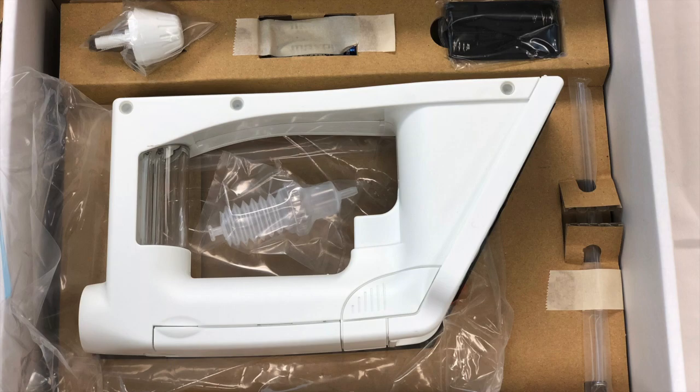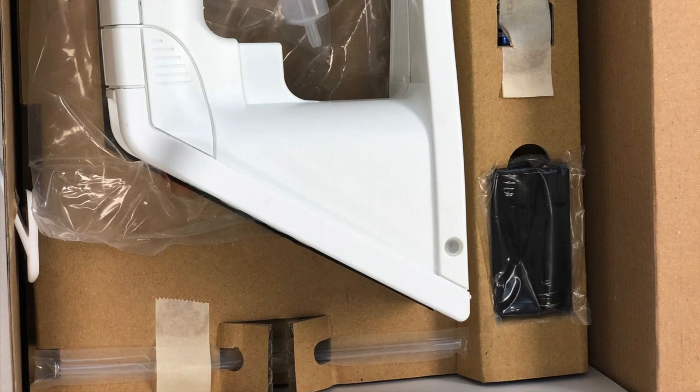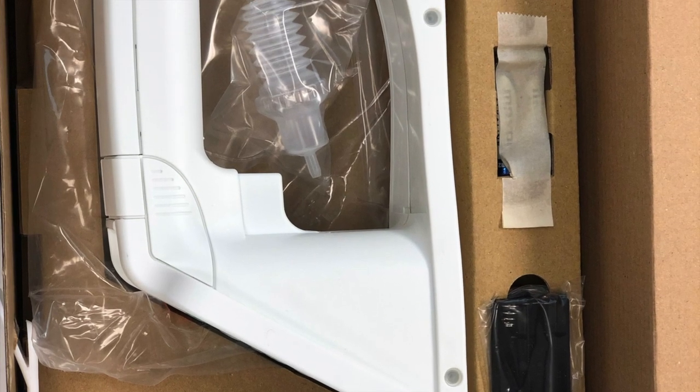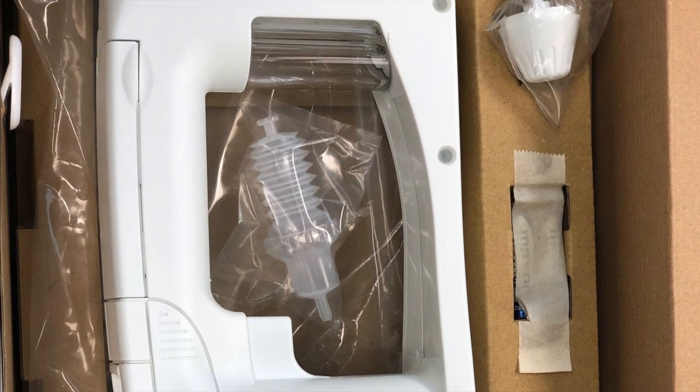Inside the box, it comes with the main unit. You have your nozzle, the battery compartment and batteries, as well as the nozzle connection.